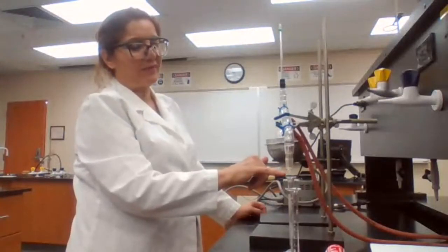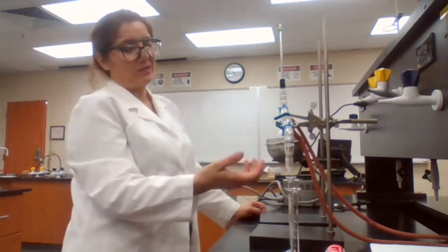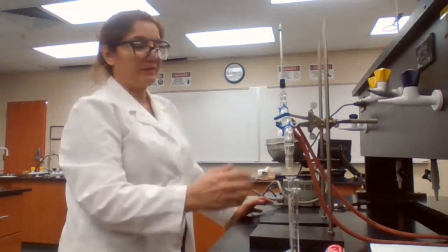So we see vapor escaping, and that vapor escaping means what? You're losing sample. You're not going to be able to recover the sample entirely. You're going to get it partially, and you lose some of the sample. Two problems with that: low percent recovery. A second problem, you don't want to inhale the vapor of those chemicals. So this is start boiling. The assembly of distillation is the major concern for this experiment.